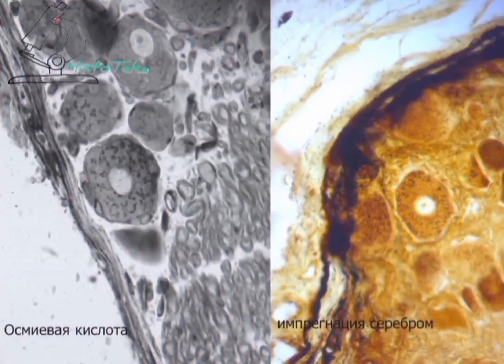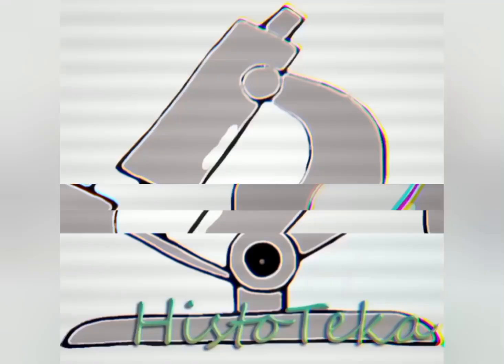As can be seen when comparing the two preparations, osmic acid clearly reveals a greater number of dictyosomes and in a larger number of neurons. This is due to the fact that osmic acid is lipophilic. Lipid membranes are at the base of dictyosomes.